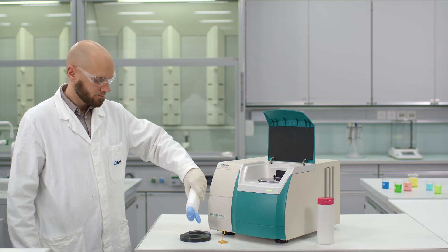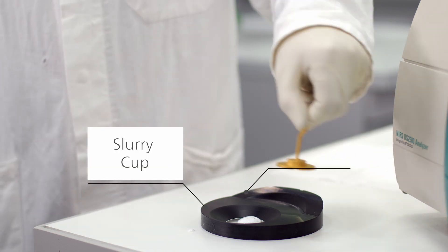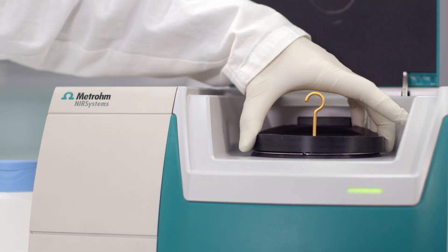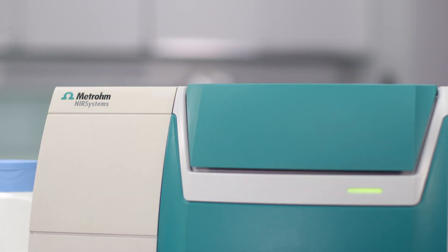Sample handling is easy with this slurry cup. Let me show you how it works. Just pour the sample into the slurry cup, place the gold reflector on top, position the sample in the DS2500 Solid Analyzer and close the lid.